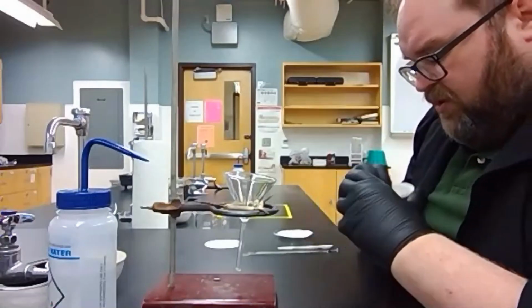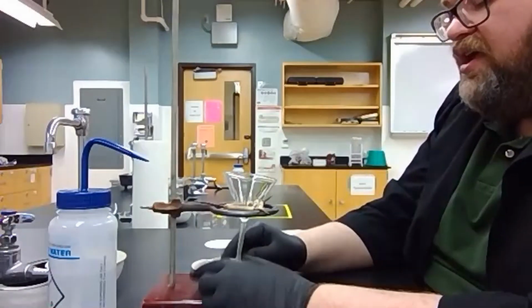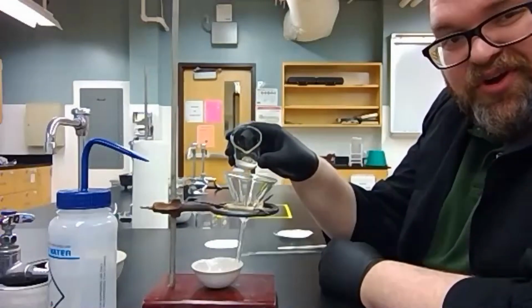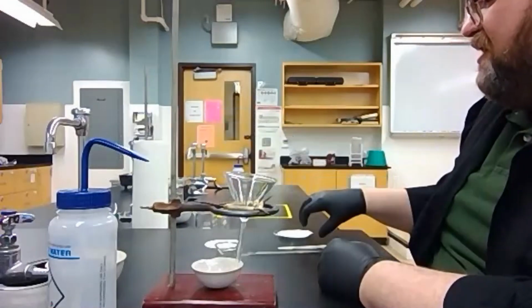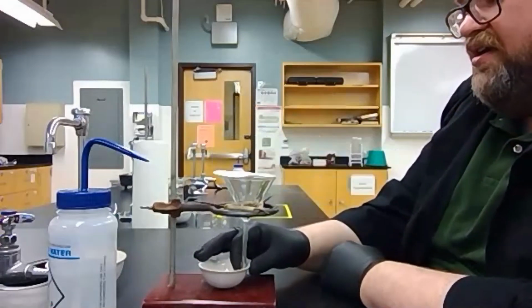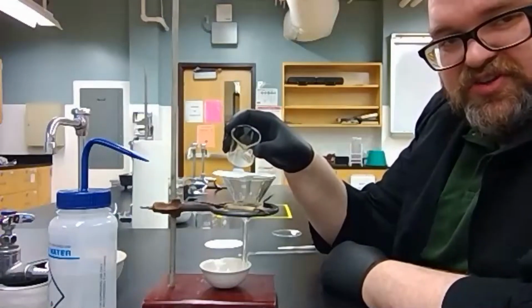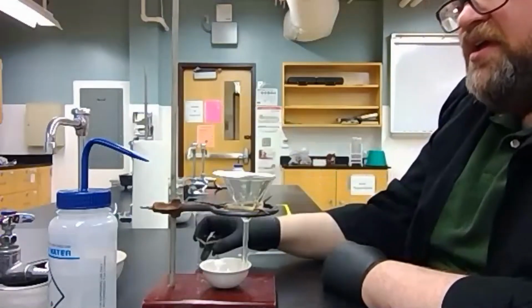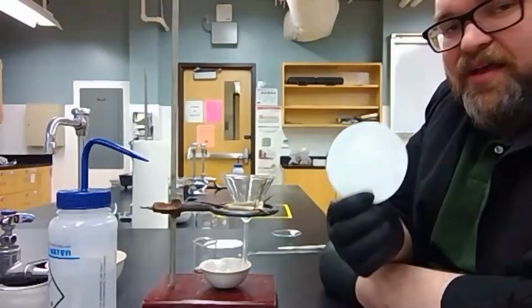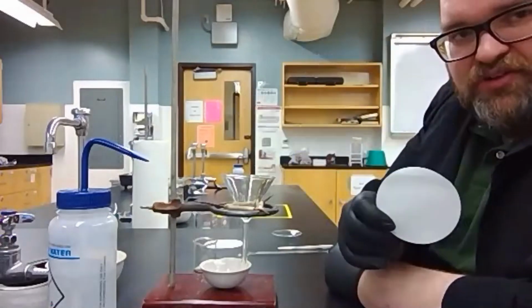So now, there's schmutz in my evaporating dish. Now, if I just need to pour, but that's not going to work, is it? Okay. So instead, I'm going to take a piece of filter paper and put that right on top like that, and then now I can just, but the water's just going to go everywhere. So I need to actually prepare this filter paper in some kind of way that's going to allow me to put it into the filter.